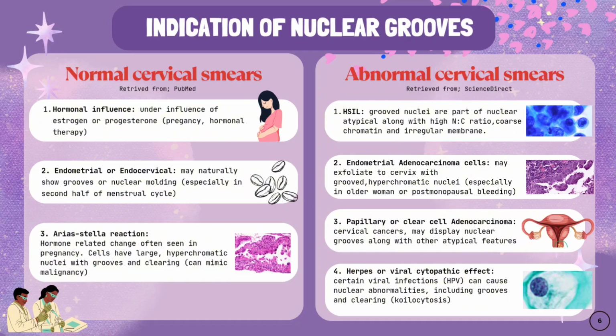Overall, we can conclude that while nuclear grooves can be benign and hormone-related, especially during pregnancy or menstruation, they can also signal serious pathology such as high-grade carcinomas or HPV infections.